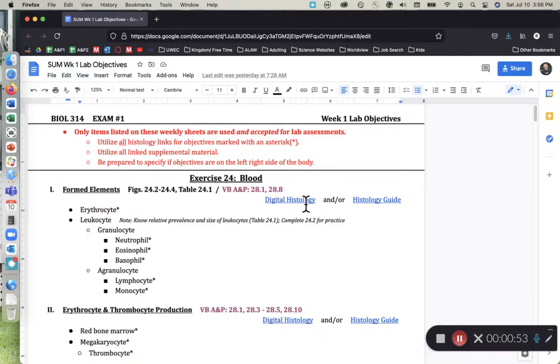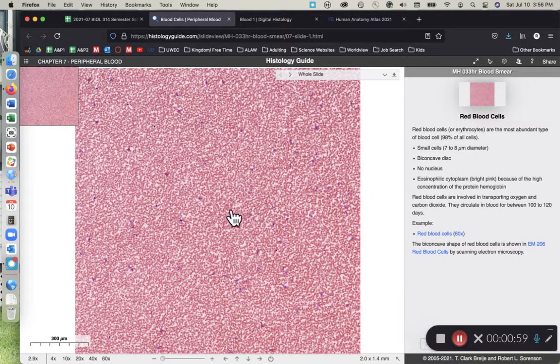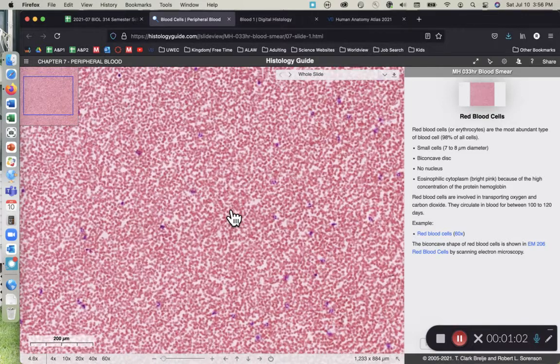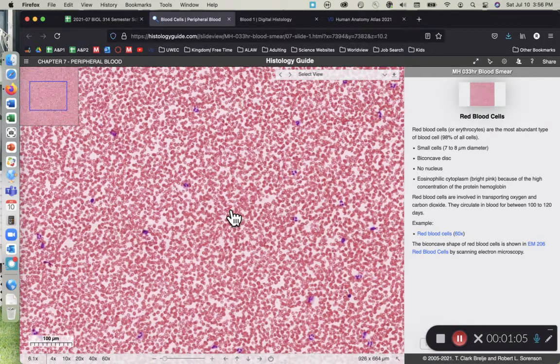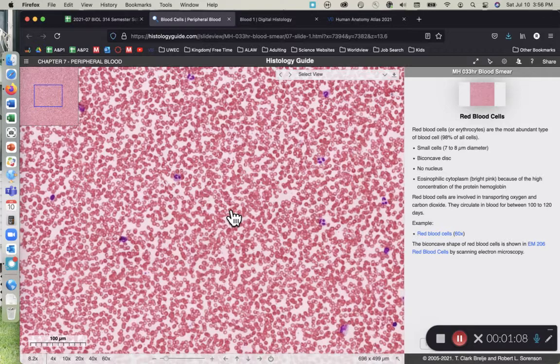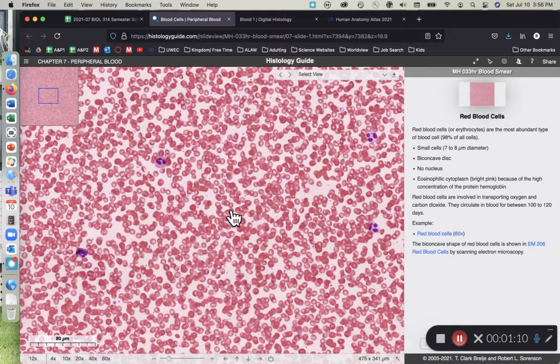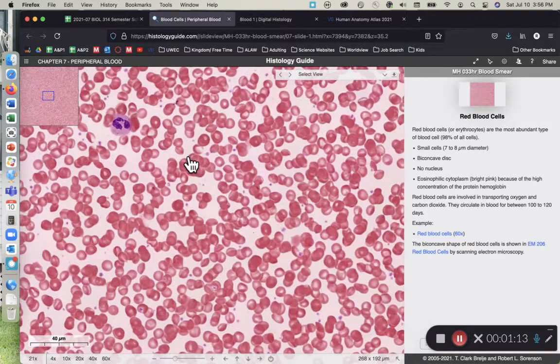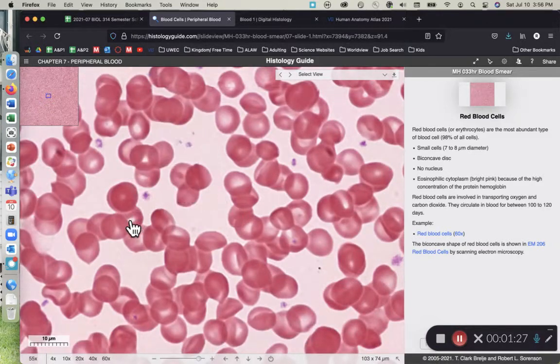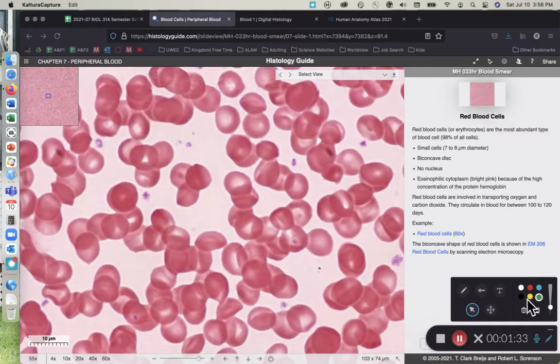Let's look at some of the histology of our erythrocytes. Here in the histology guide website, we have a plain photomicrograph of some blood. As I'm zooming in, you'll notice these little red or light pink circles. These are the erythrocytes. They are by far the most common kind of formed element or blood cell within our human blood. It's important that you familiarize yourself with these erythrocytes. I'm going to annotate one for you.